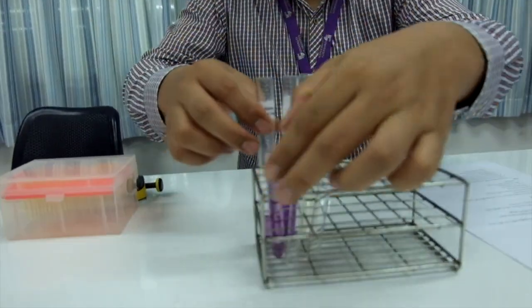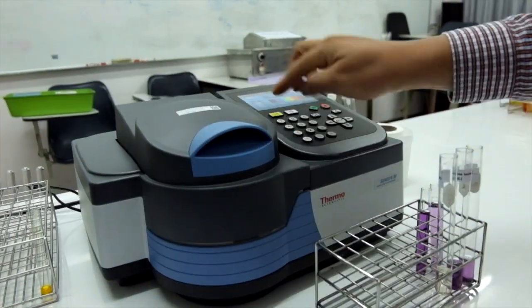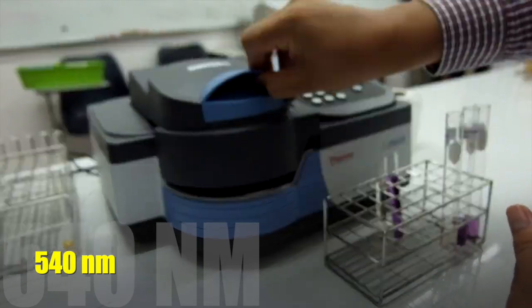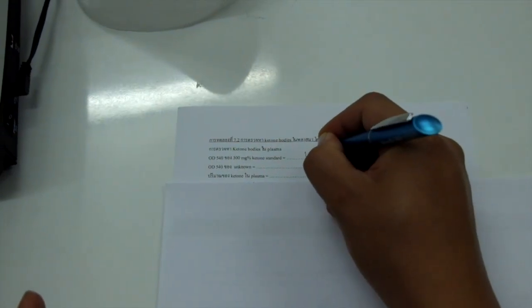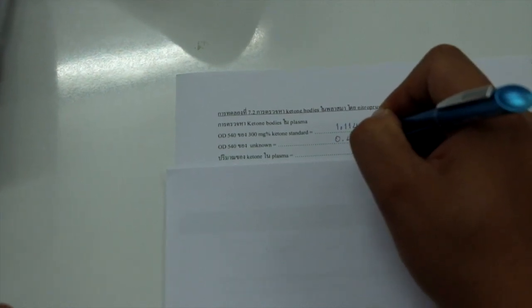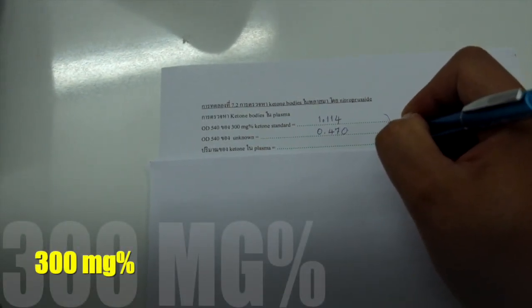Pour a certain amount of the solution in each test tube into cuvettes. Measure the absorbance of all cuvettes at 540 nanometers using the distilled water sample tubes for setting 0. Record the absorbance and calculate ketone bodies concentration in the unknown plasma, referring to 300 mg% standard ketone body absorbance. Take a note for the calculated result.